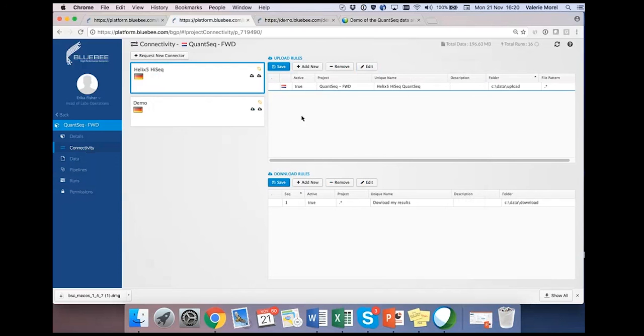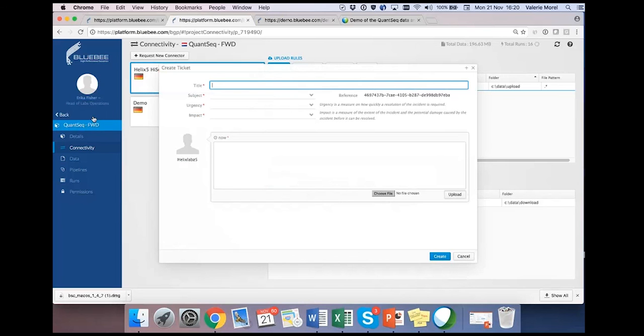This is from an operations perspective how things would work. There's a few little other things that I'm able to show you. First of all, if you are in trouble for some reason, you can always create a support ticket, and you will get in touch with our help desk. So you let us know what your problem is, and also through the same user interface, our help desk will answer your question.